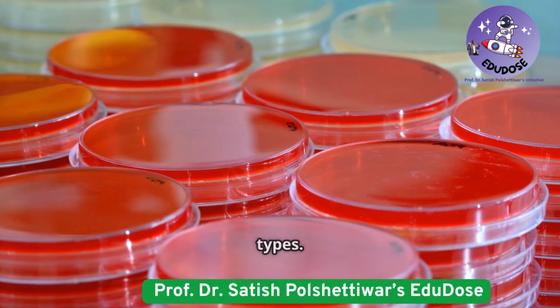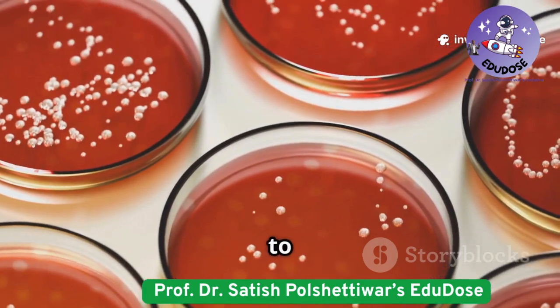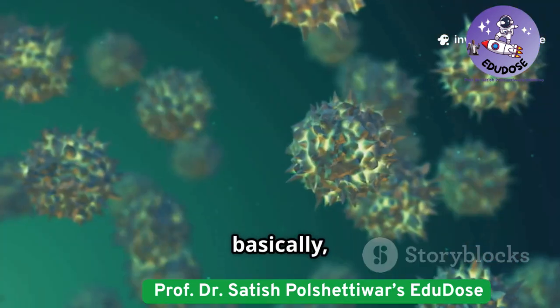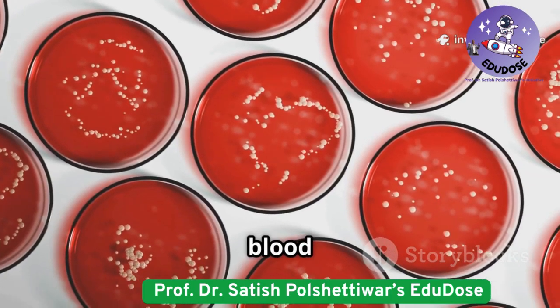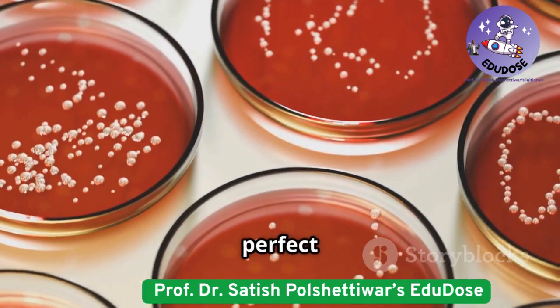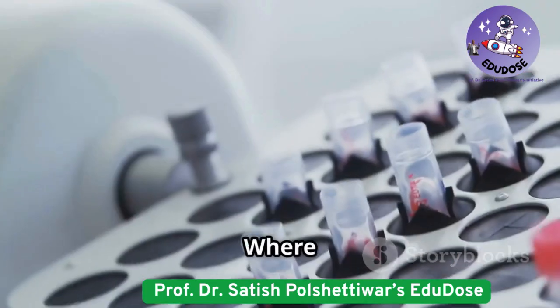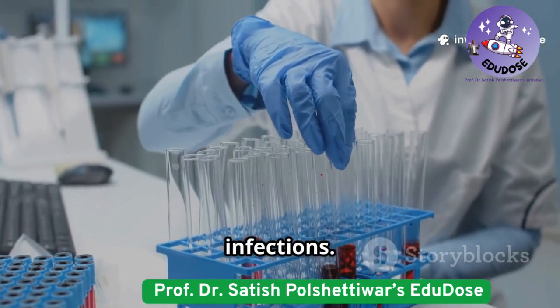Now let's break down the types. First up, enriched media. This is used to grow fastidious organisms, basically microbes with really picky nutritional needs. For example, blood agar supports the growth of Streptococcus species, while chocolate agar is perfect for Neisseria gonorrhoeae. Where does this matter? Diagnosing respiratory or sexually transmitted infections.